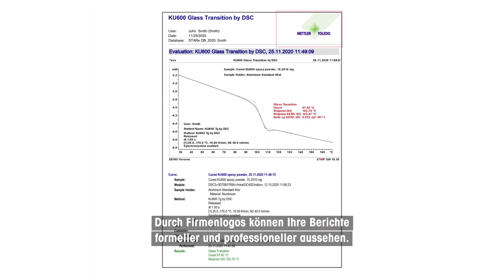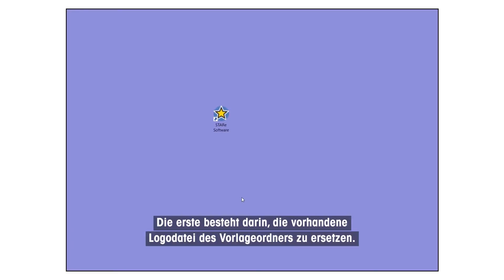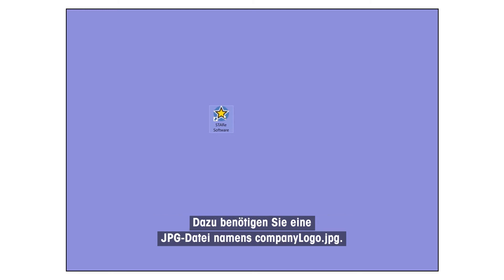Company logos can make your reports look more formal and professional. There are two ways to add your logo. The first is by replacing the existing logo file in the Templates folder. For this, you need a JPG file named CompanyLogo.jpg.